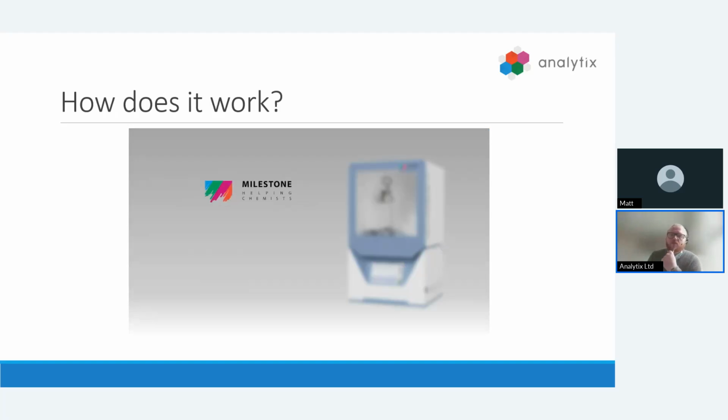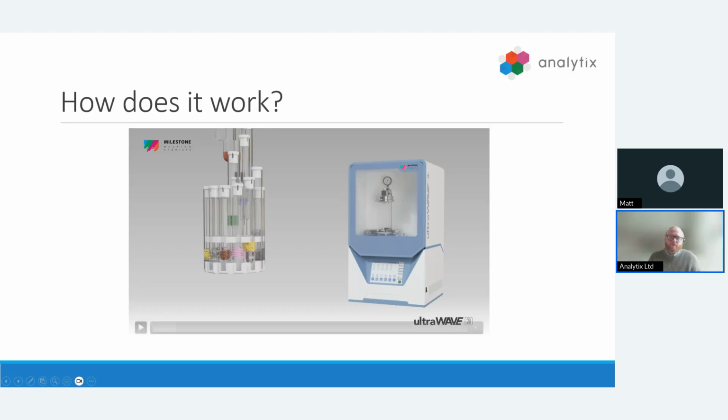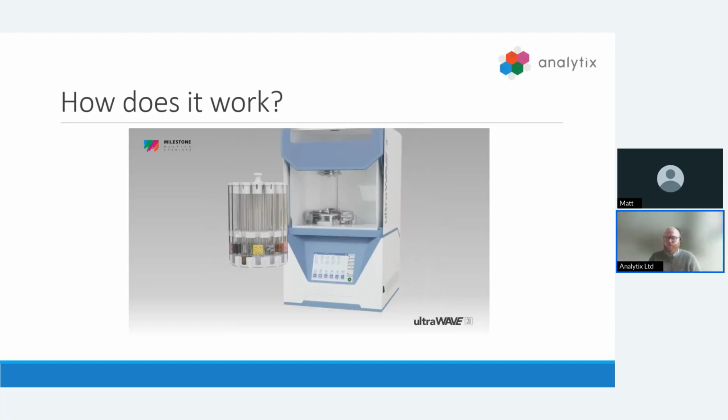So instead of working with the vessels that we talked about for microwave digestion, we use vials with push-on caps. These can be seen here. You have your vials and your push-on caps, a simple two-part system. And these can be made of either Teflon, quartz, or disposable glass, depending on your sample requirements, what elements are of interest, and your acid chemistry. These samples are weighed and loaded into the vials with that appropriate acid chemistry.